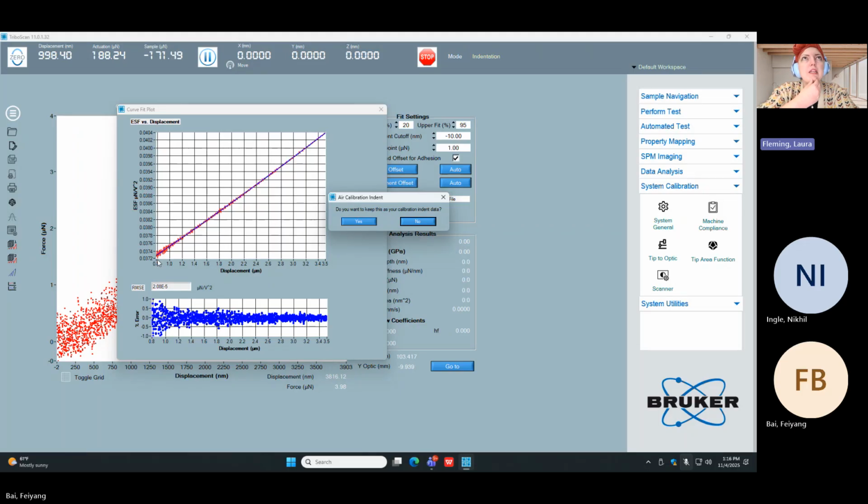At lower displacements, it's a higher percentage of the noise. If the noise is the same displacement value throughout, the percentage is going to be larger at the lower end. The error, I think here is 0.5 to 1 max, so that will be plus minus 1%. So the error margin is like plus minus 1% here.